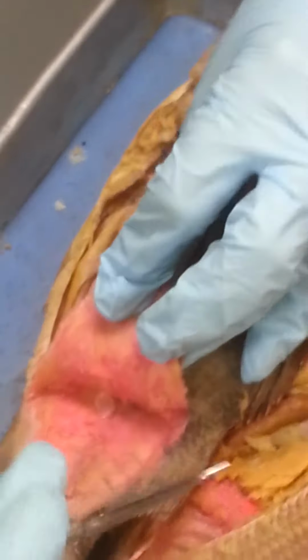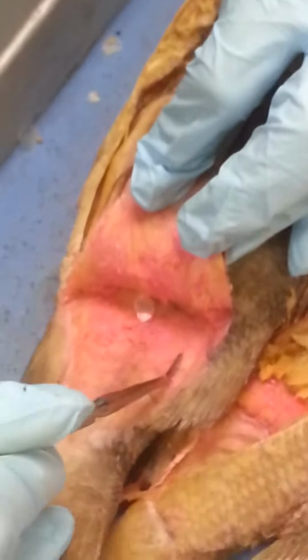Then you have your epaxial musculature and hypaxial musculature, and how I remember which one is on top and bottom is the same as the afferent and efferent branchial arteries. So your efferent and your epaxial, the two E's are on the top. Okay.